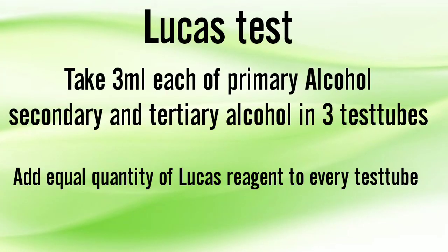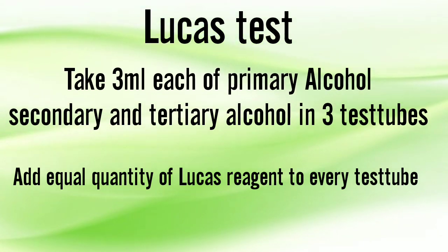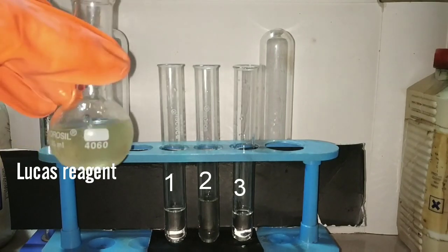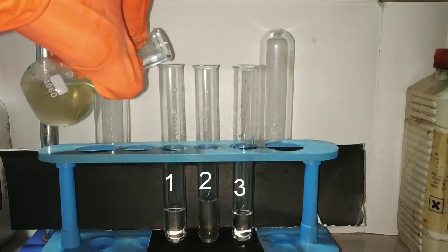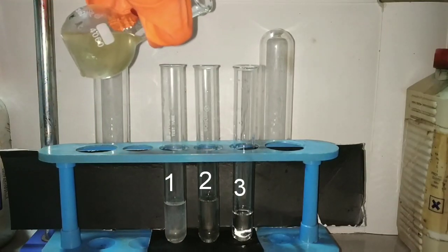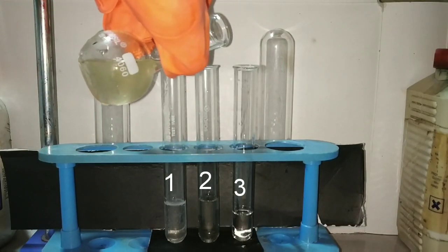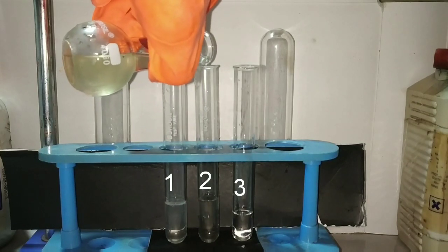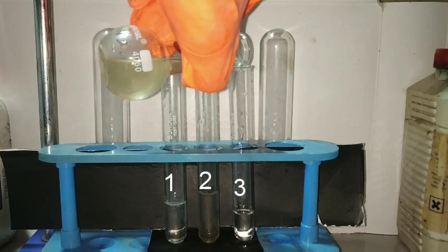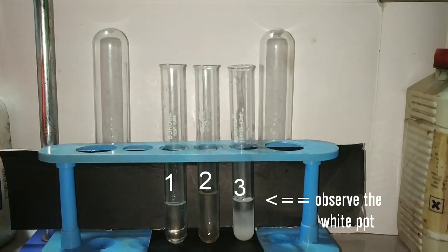Now we go to the Lucas test, where we take 3 milliliters each of the primary, secondary, and tertiary alcohol in separate test tubes and add equal quantities of Lucas reagent, looking for any formation of precipitate. In the primary alcohol there is no precipitate formed. In the secondary alcohol also there is no precipitate, but in the tertiary alcohol you can see that there is formation of a white precipitate.